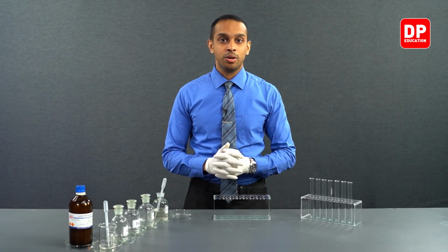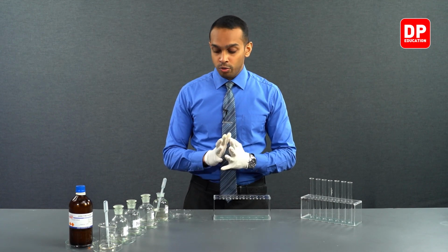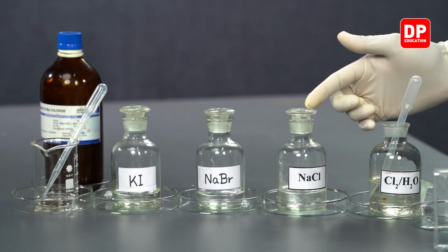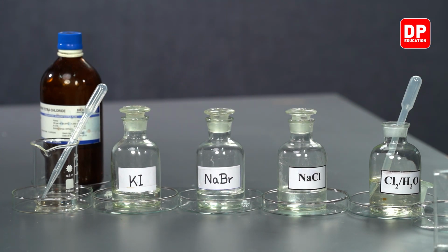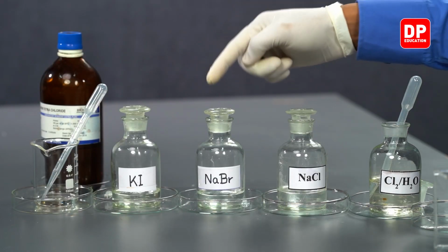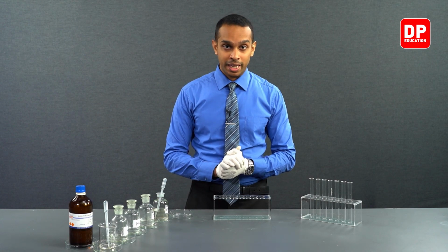Students, now let's talk about the chlorine water test for halides. In this test, we will be taking a look at how sodium chloride solution, sodium bromide solution, and potassium iodide solutions react in the presence of chlorine water. As you know, these halide ions will react with chlorine water, except for chloride. When they react with chlorine water, the halide ions will be displaced.